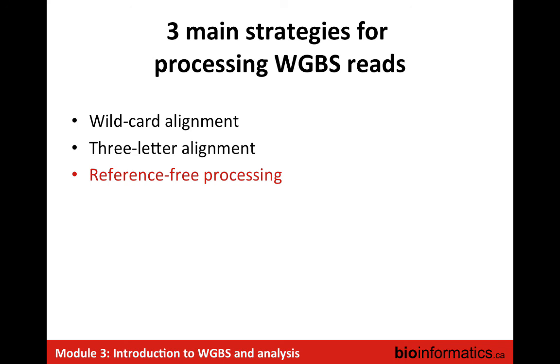So the last thing I wanted to touch on, in terms of ways of analyzing whole genome bisulfite sequence reads, is a new and promising approach, but that's still under development. There was a question yesterday about reference-free analysis, or what happens if you don't have a reference genome. The idea is, because these reads don't typically map directly on the genome because of this conversion, could you forget about the reference genome and work directly off the reads themselves?